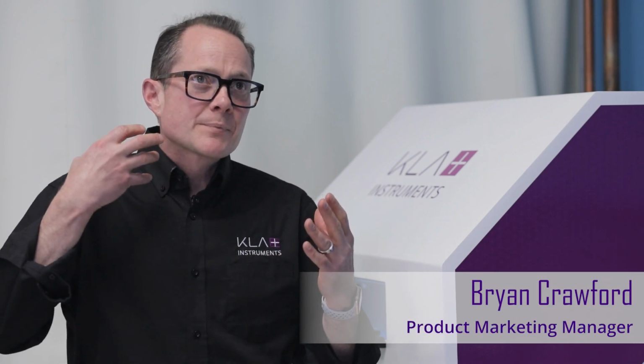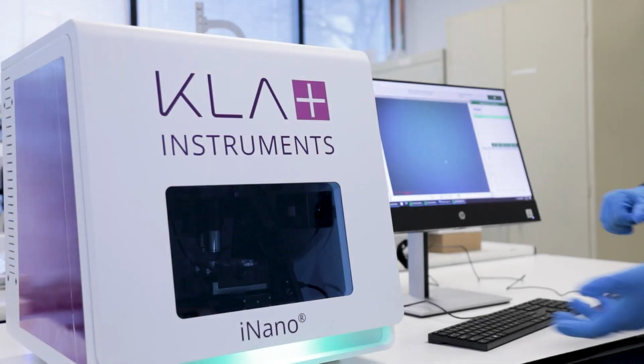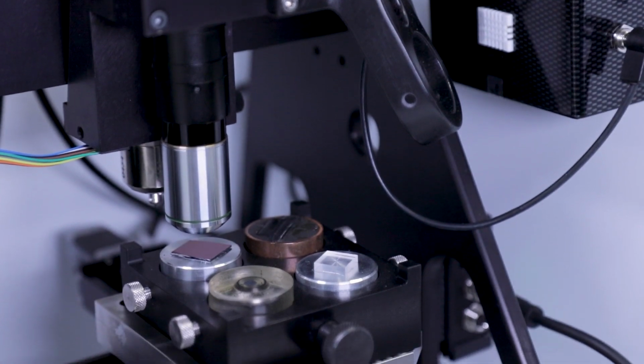Nanoindentation, at its foundation, is probing the surface of a material system, trying to understand its response and how it accommodates stress. And during indentation, actually, materials can accommodate stress in a lot of different ways. They can accommodate it through plasticity, through elastic deformation, but also through fracturing. All of these failure mechanisms or deformation mechanisms in these material systems are captured by the nanoindenter.